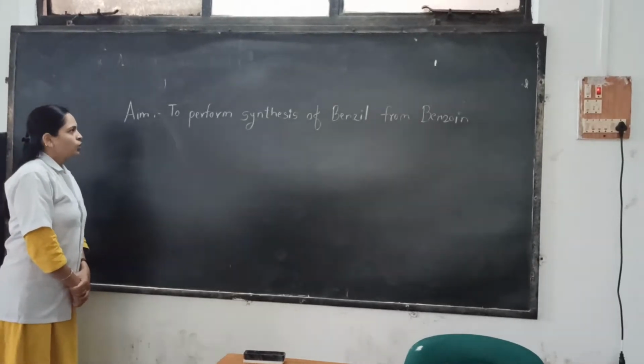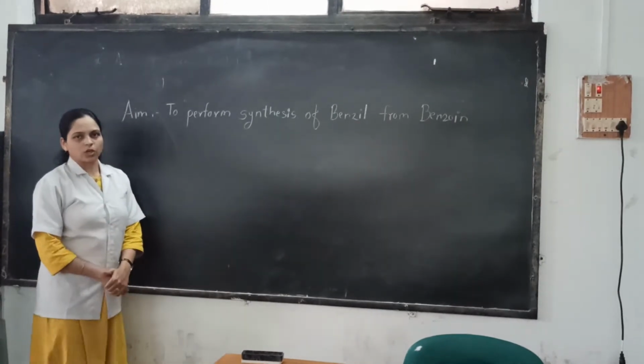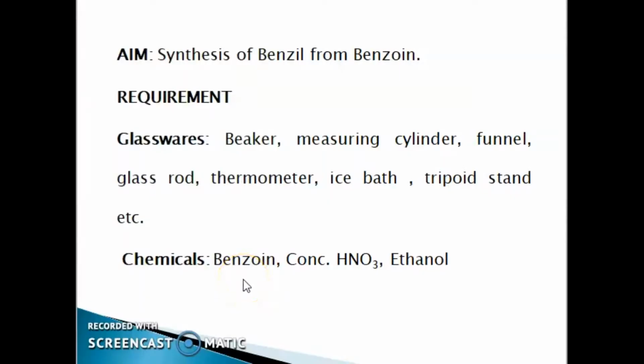Hello students, today we are going to perform the synthesis of benzil from benzoin. Students, now we will see the requirements for today's practical, that is the synthesis of benzil from benzoin.